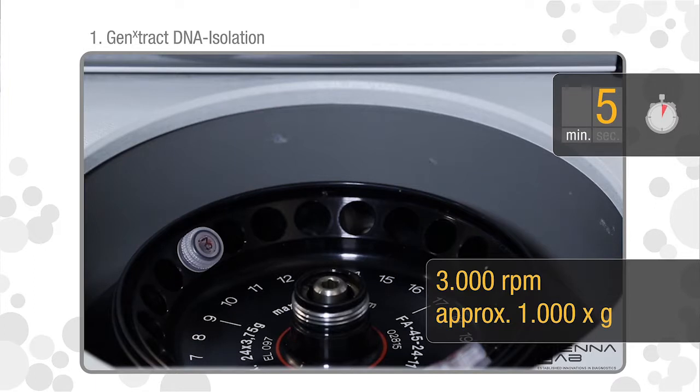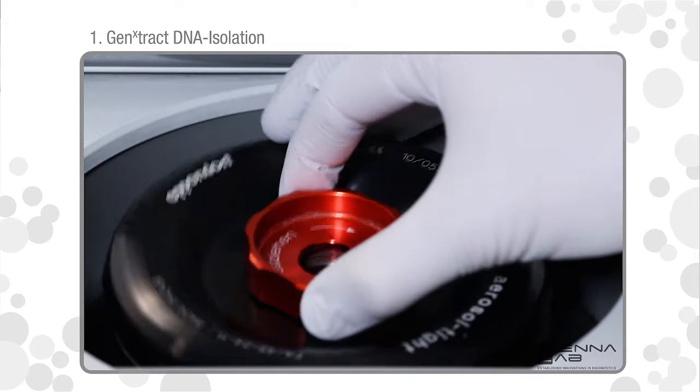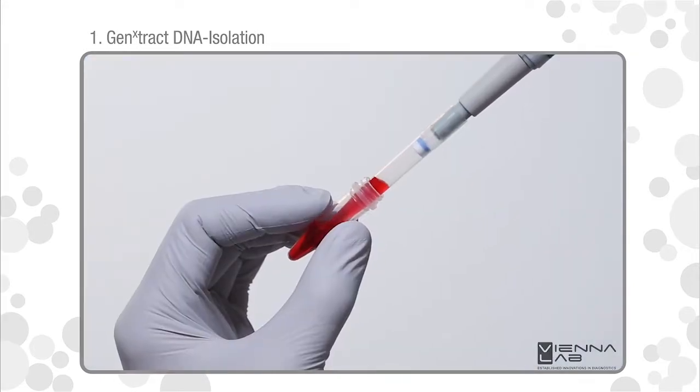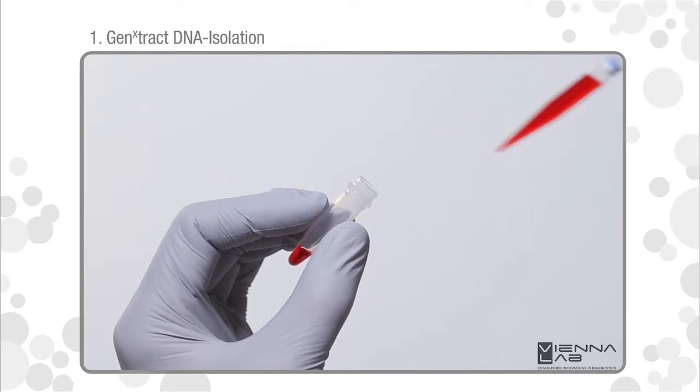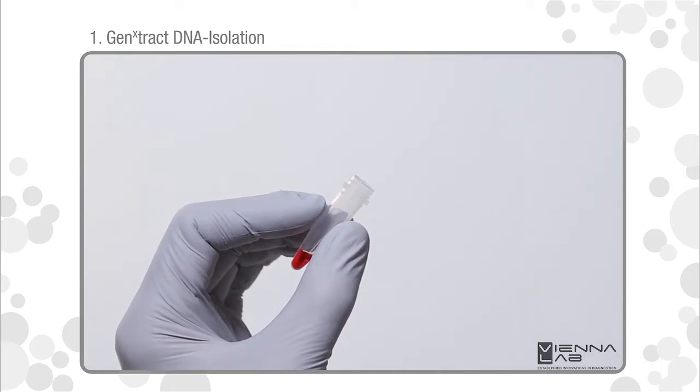Centrifuge for 5 minutes at 3000 RPM in a micro-centrifuge. Remove and discard the upper 1 milliliter of supernatant. Leave the pellet undisturbed.